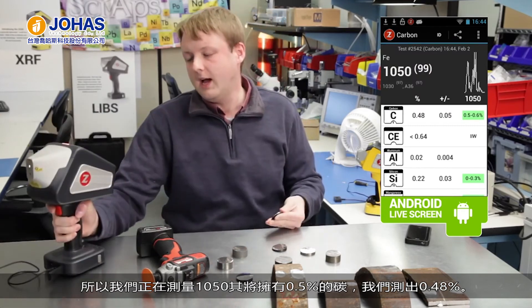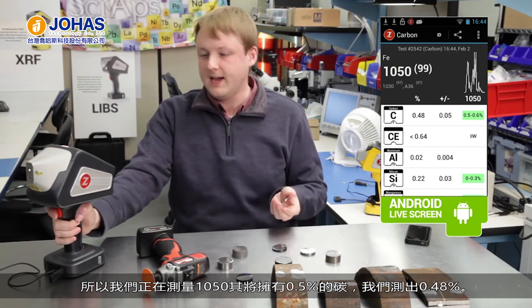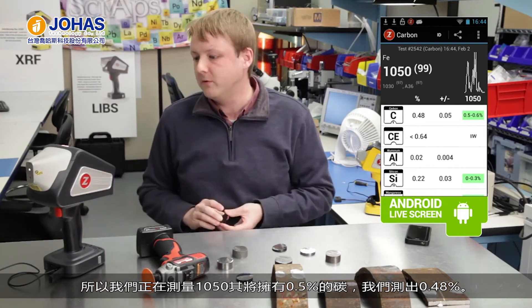Yes, we're testing a 1050 now, and it has half a percent carbon. We're coming out at about 0.48% — very good.